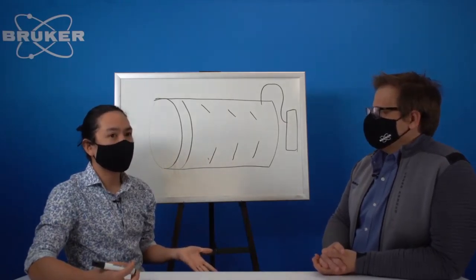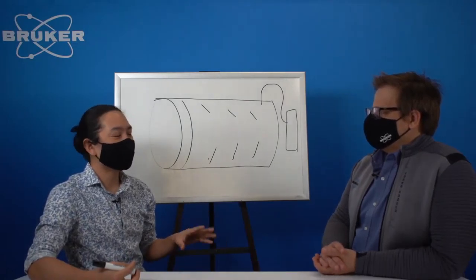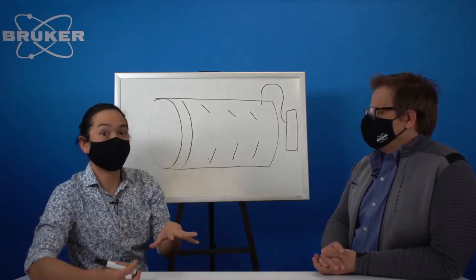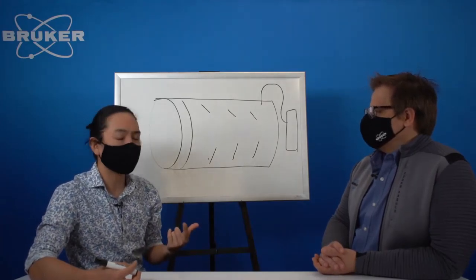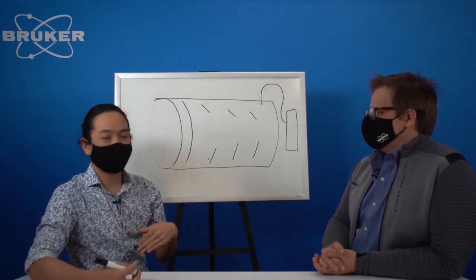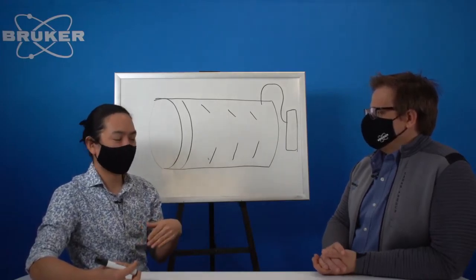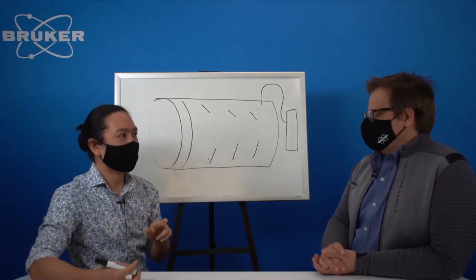I guess to give a frame of reference, when we had our older system, 20-some odd years ago, it was an hour to take data that would be useful at all, just to say, does it diffract? What's in this? Basic phase ID. And if you wanted to publish, or wanted something for a poster or a paper or a conference, you would either take the whole afternoon, take an overnight slot, or bribe someone to give you the single weekend slot. And you would run the whole system for 48 hours, from Friday night through to Monday morning. And you just cross your fingers that no one opened the door or took your sample off.